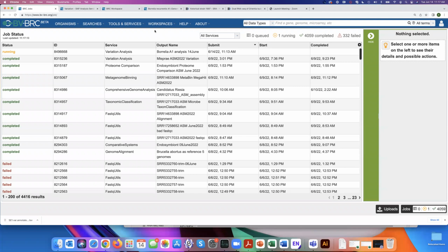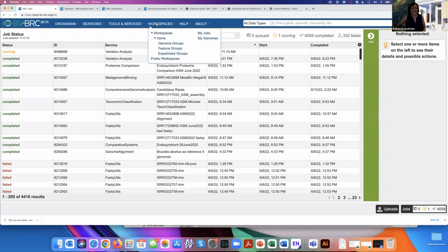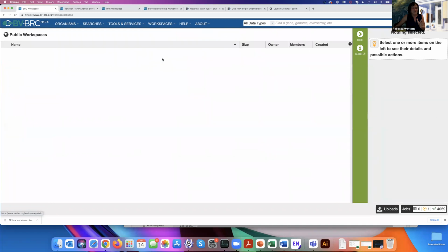That's right. So for everybody else, if you have additional questions, obviously feel free to either type in the chat window or just unmute yourself and ask a question. You're welcome to do that. All right. So let's see what this job looks like, and I've put it here for you. So let's go into public workspaces.